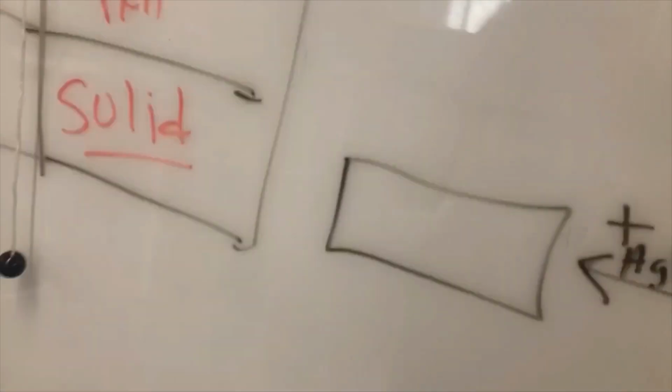So maybe there's 2 different compounds of 2 different pHs that are bringing it down. So I would call it basic, pH around 9. So that is the pH.